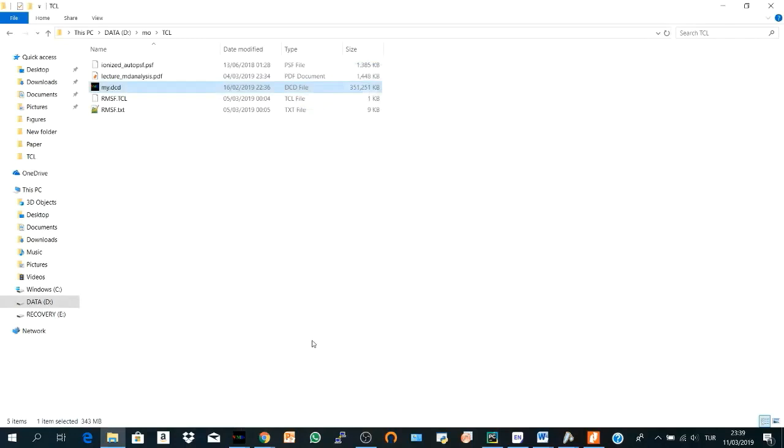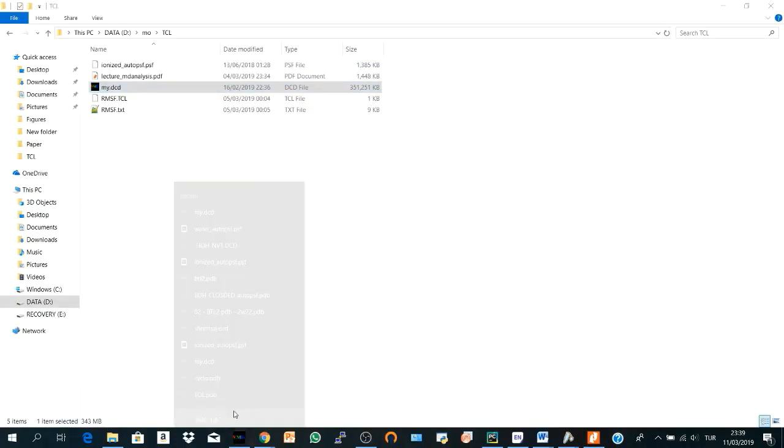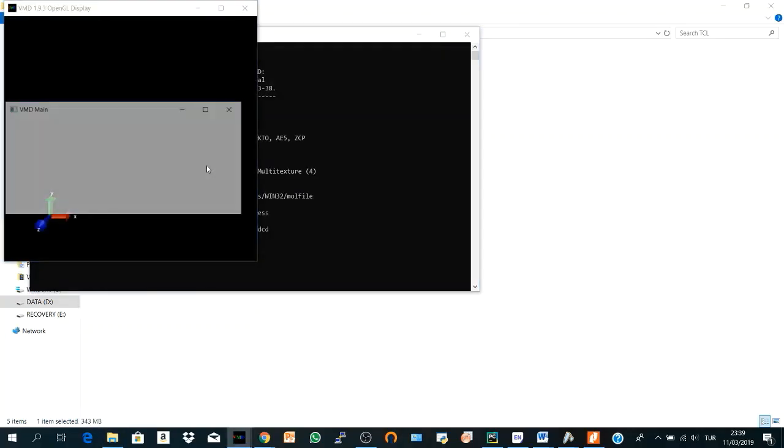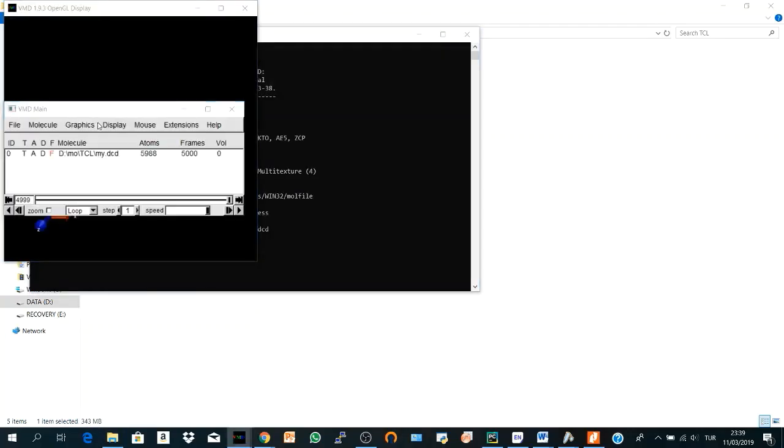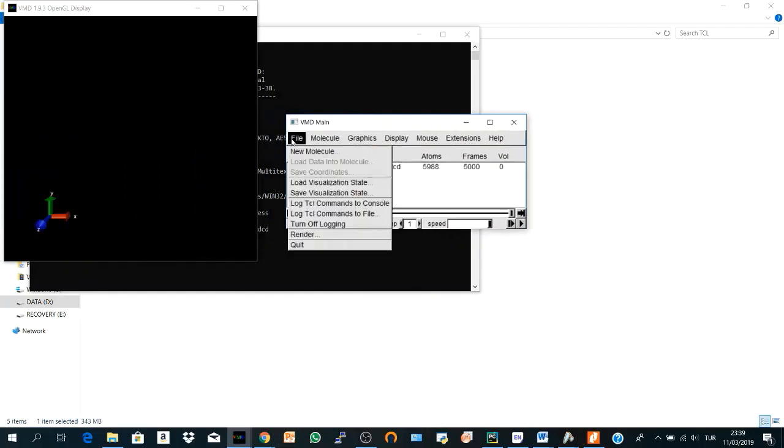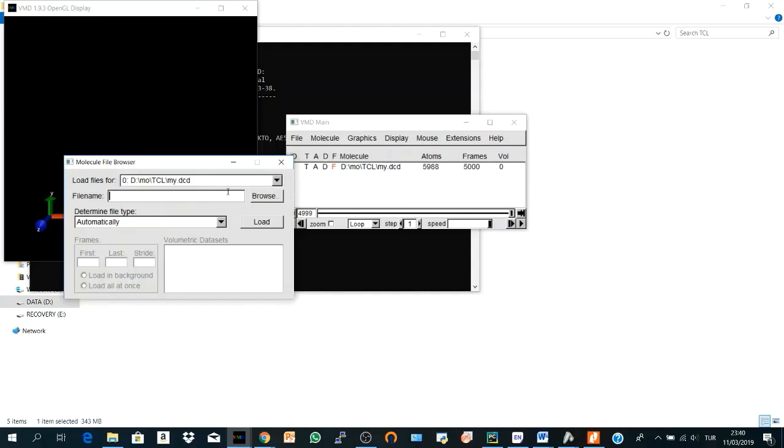I'm getting my trajectory and we will also need to get our PSF file for our trajectory.